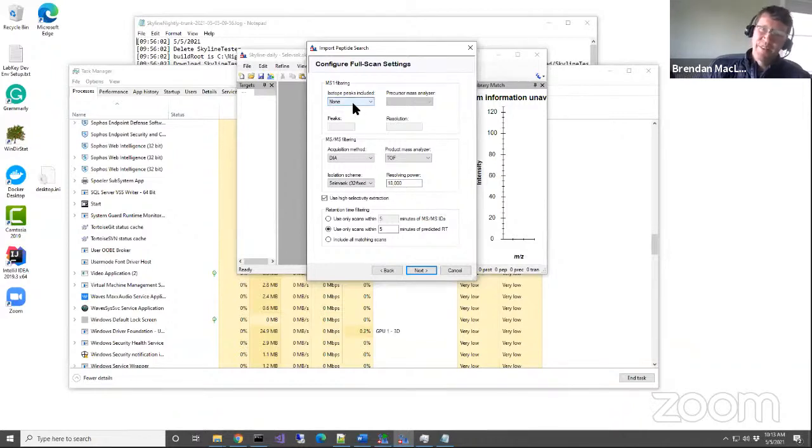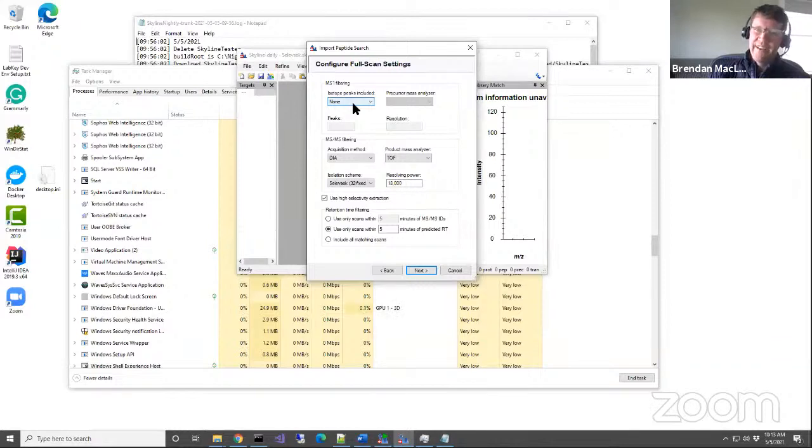But it's definitely possible to have MS1 filtering, and I do believe that slightly improves your peak picking. And then it gives you another axis to look at things on, which is actually more confusing teaching. So that's another reason I don't do it teaching.